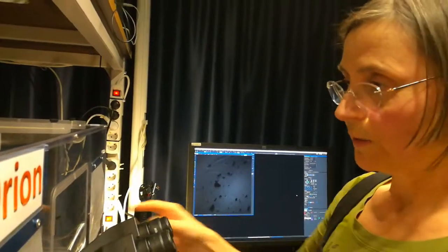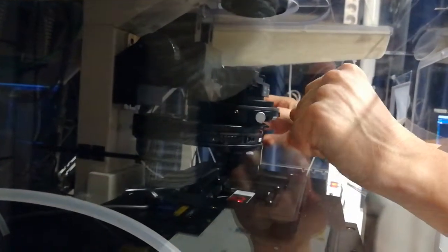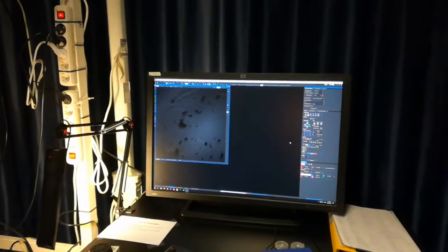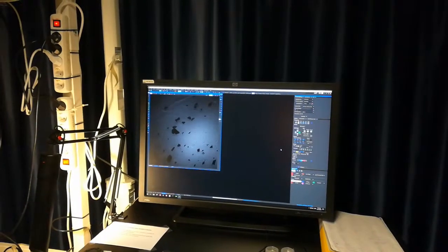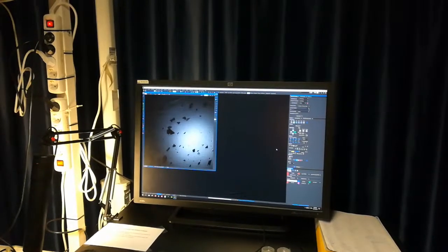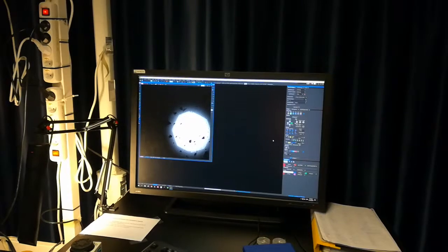The condenser is basically defocused — it's in the wrong place in X, Y, and Z. The aim of Köhler illumination is to put it in the correct position in X, Y, and Z. The first thing I'm going to do is move the condenser in Z using these big black knobs. On all other microscopes they look a little bit different, but you always have knobs that will move the whole thing up and down. When I move this, if you look at the screen, you will see the condenser moving up and down. In one direction it's going to become brighter — that's where I want to go. So I bring the condenser down, it goes brighter and brighter, and then I can see this spot coming. This is actually the shadow of the field stop, which is closed.